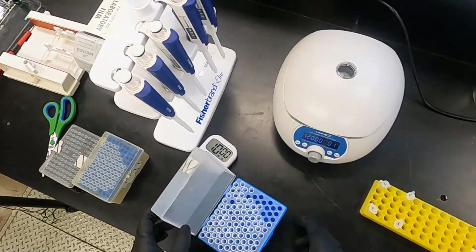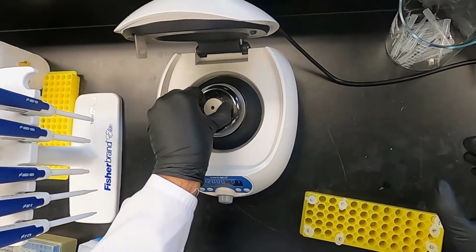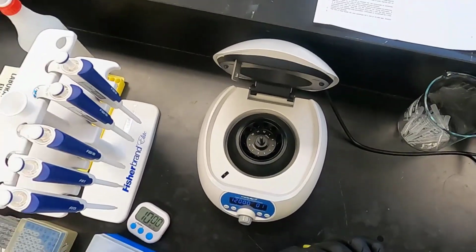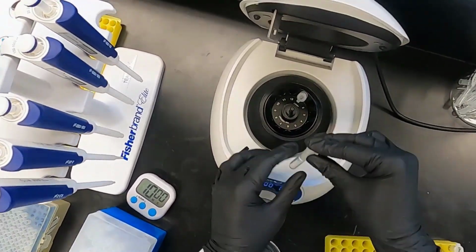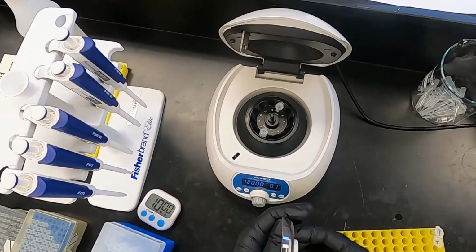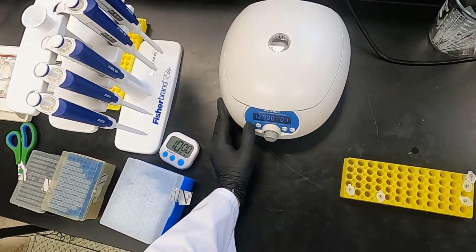Now we're going to spin these columns at 12,000 RPMs for 1 minute. So we're going to open our mini centrifuge, remove them, and we're going to ensure that we place our tubes opposite to each other. So we're going to place one in the 1 position, and the other one is going to be placed at the 7 position. They should be opposite each other, so they offset each other. And now we're going to let this run for 1 minute.